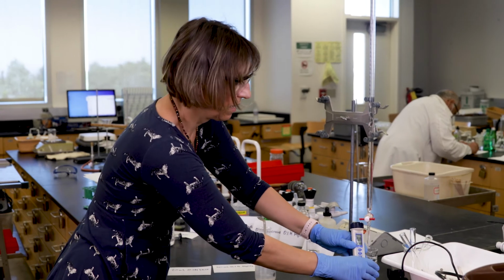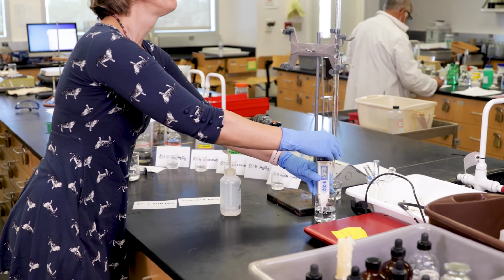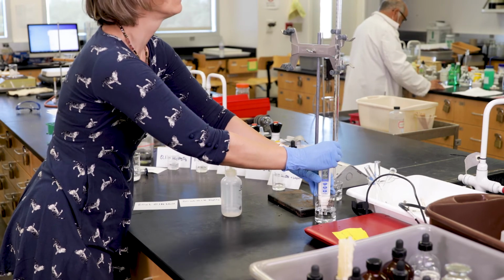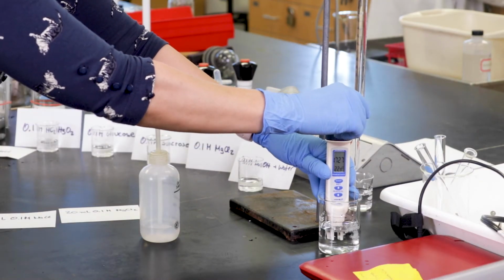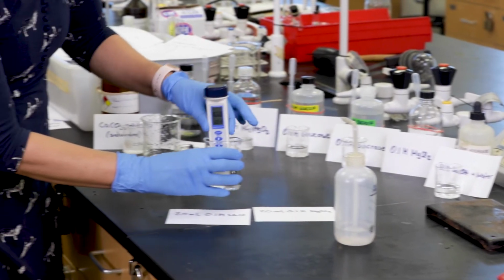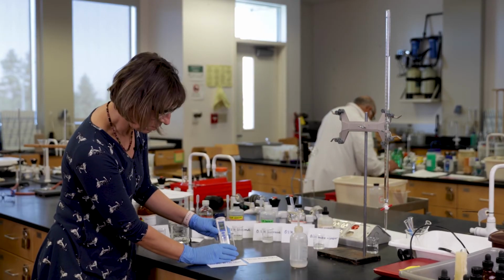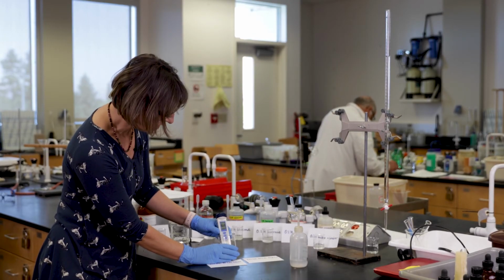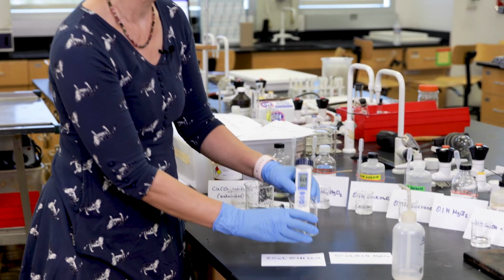So now we're going to add another 10. We will have added a total of 60 milliliters. Let's see what it does. See, the conductivity continues to drop. It's now at 1,669.